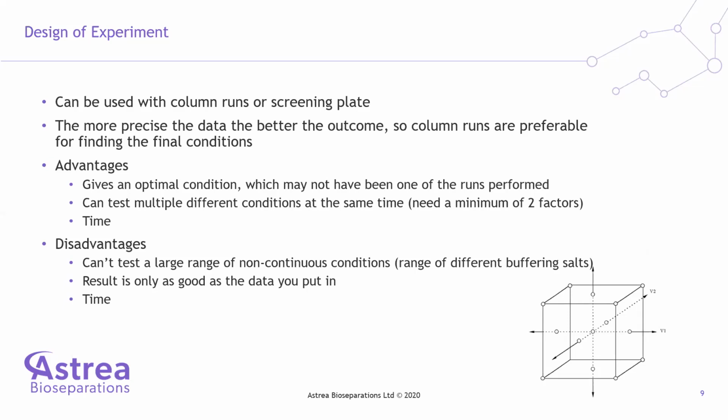The other disadvantage of this approach is that you can't test a large range of non-continuous conditions, such as different buffering salts. And in addition, the results are only as good as the data that you put in. If you've got assays that aren't particularly accurate, it means that the result that you get isn't going to be particularly accurate either, so you may not be getting your optimal result.